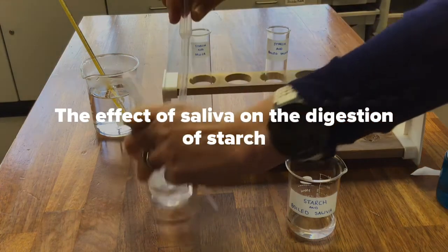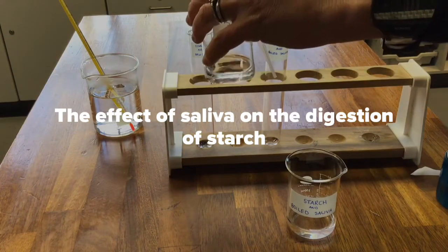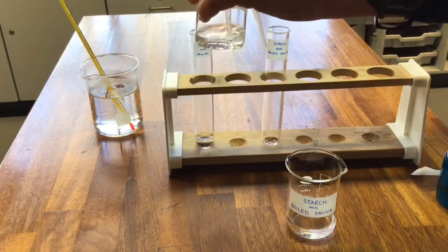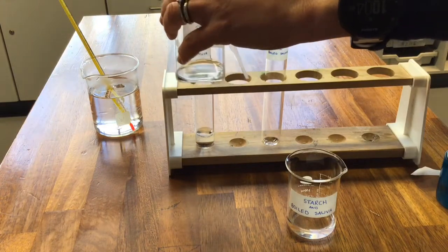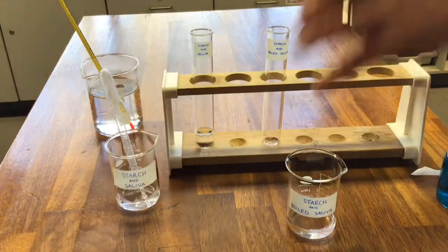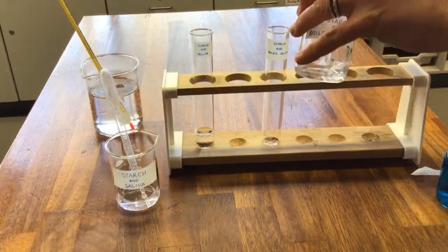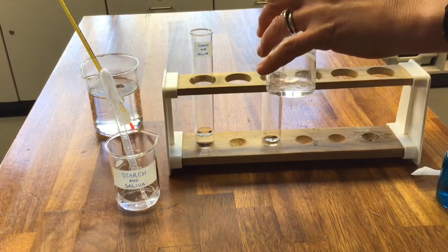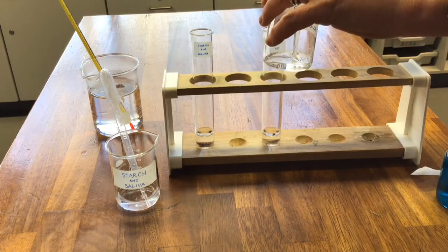So in each one we will add the same amount. So we've got starch and saliva in test tube A, and then we have boiled the saliva, and we're adding starch and boiled saliva mixture into test tube B.